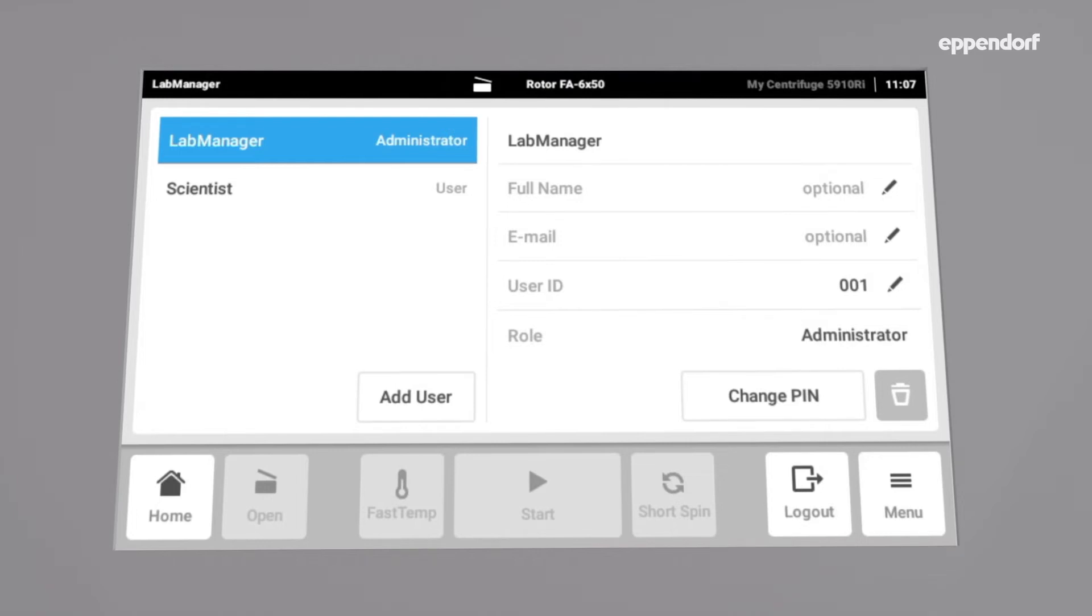As an admin, we can now create a third user, the Restricted User, with very limited rights. This role can only use preset programs, but not change parameters.